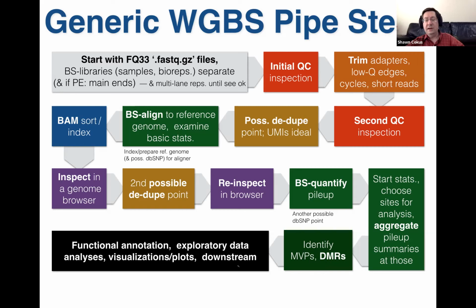So today we're going to start on this process. We're going to do the initial QC, the trimming, and work our way toward bisulfite alignment. I don't think we're actually going to get to the bisulfite alignment today. That will be the start of day 2. By the end of day 2, we'll probably be somewhere in the quantification stage, possibly into the DMR calling. And then day 3 will be more playing around with annotation, exploring, visualization stuff, and whatever overflows.